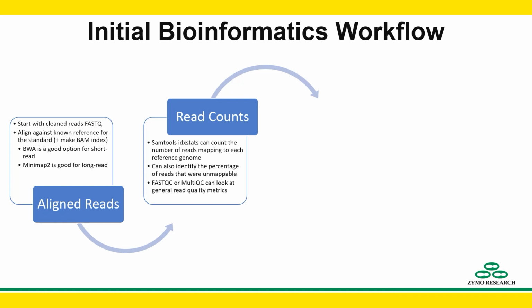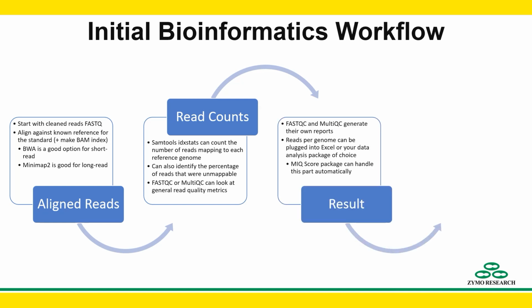Both of these, while not specifically interested in microbial standards, can give you some general metrics on your reads, which is also important to get at this point. From this, you'll get read counts and read metrics, and you can go into your next step, which is going to be starting to give yourself results.